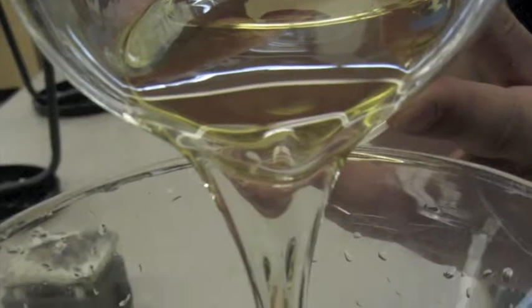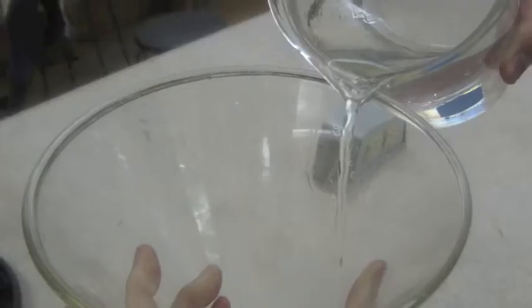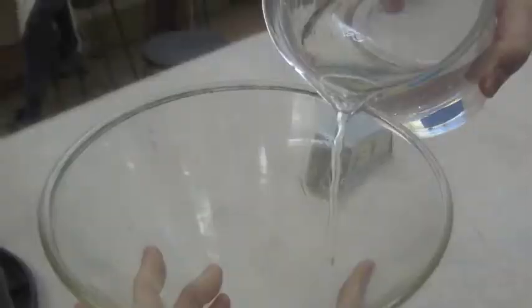Step 3: Using the funnel, carefully pour the oil into the 2L plastic bottle. Then add the methoxide solution to the oil. Step 4: Place the lid on the bottle and shake vigorously for 30 seconds. Let the mixture settle for about 10 minutes. Repeat step 4 three times.